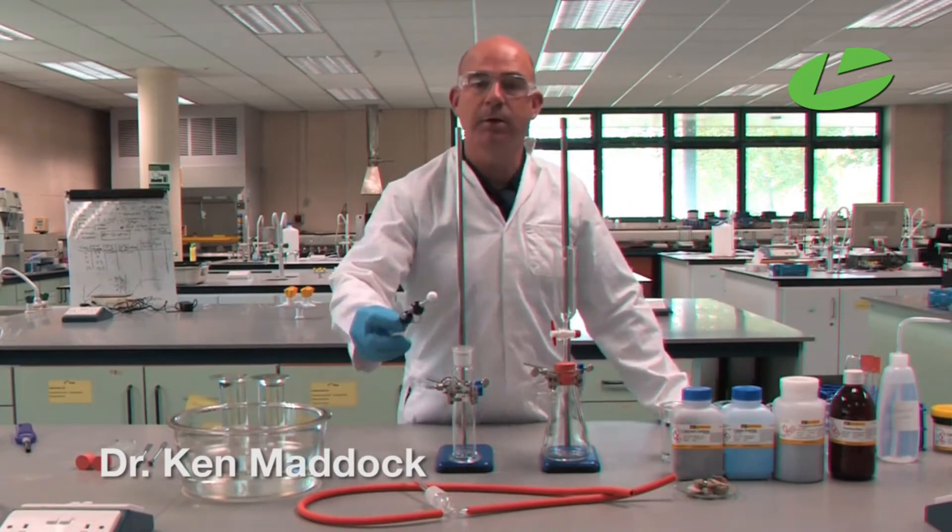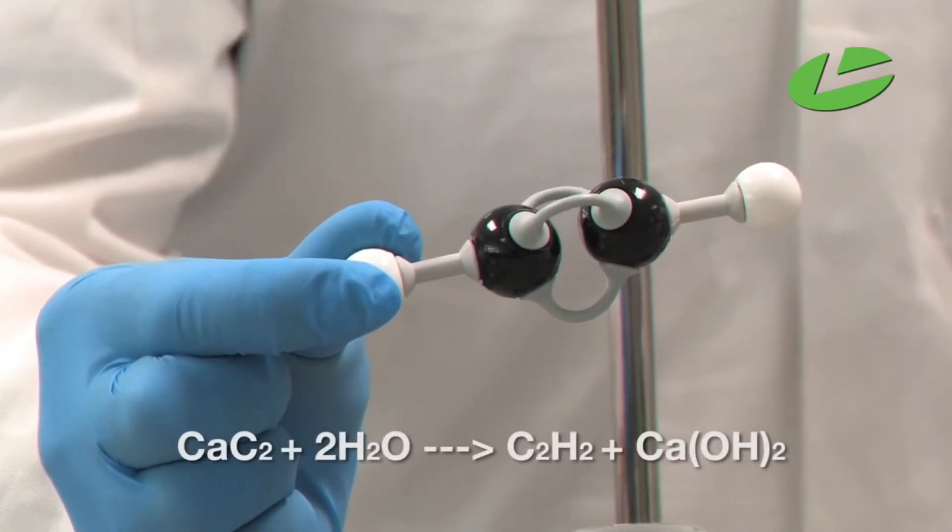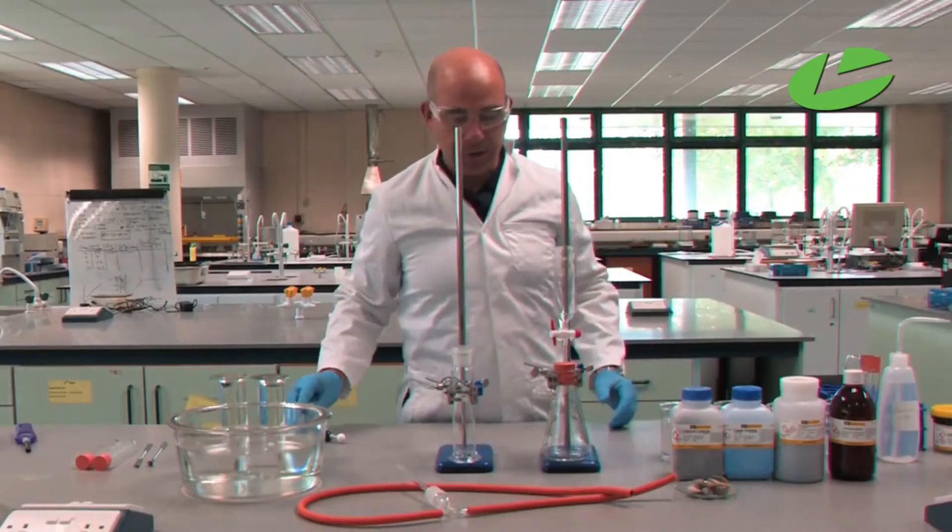In this practical, we're going to prepare ethyne gas. Here is the model of ethyne gas - two carbons bonded by a triple bond with two hydrogens at either end.